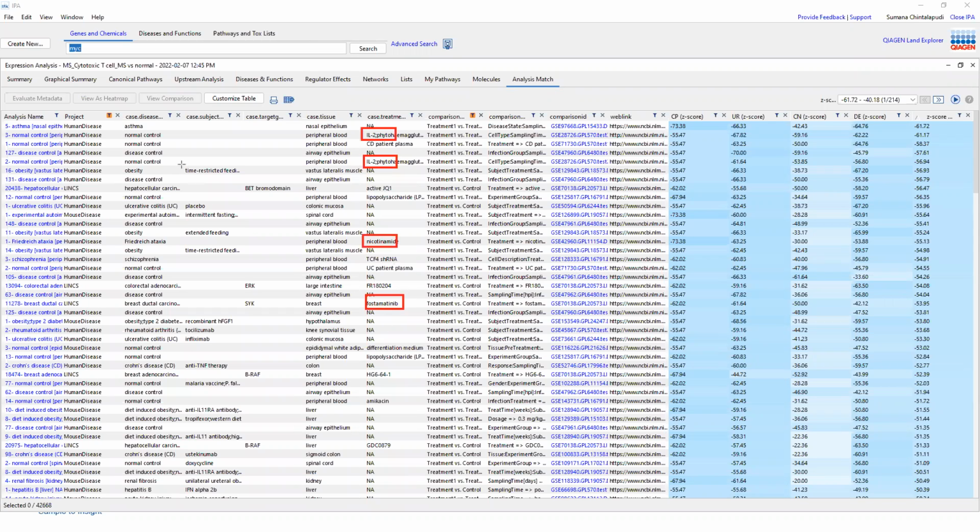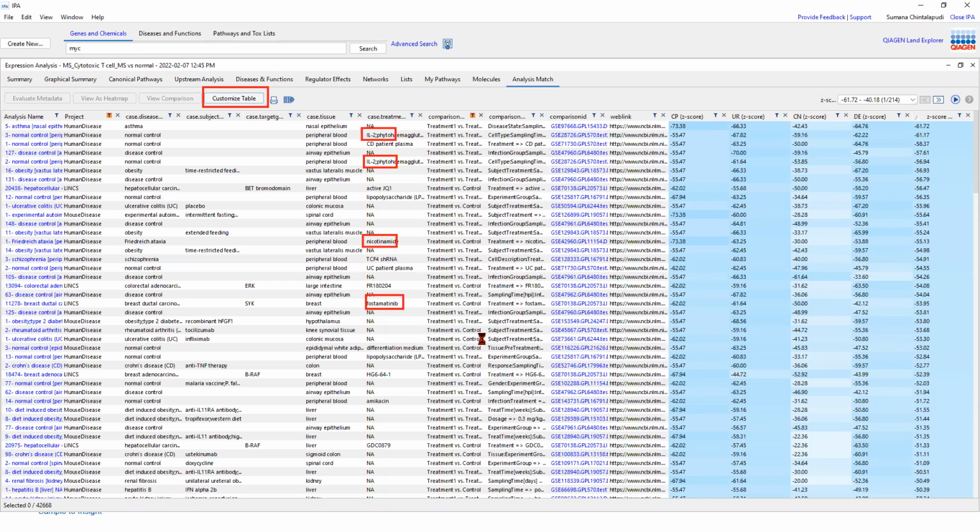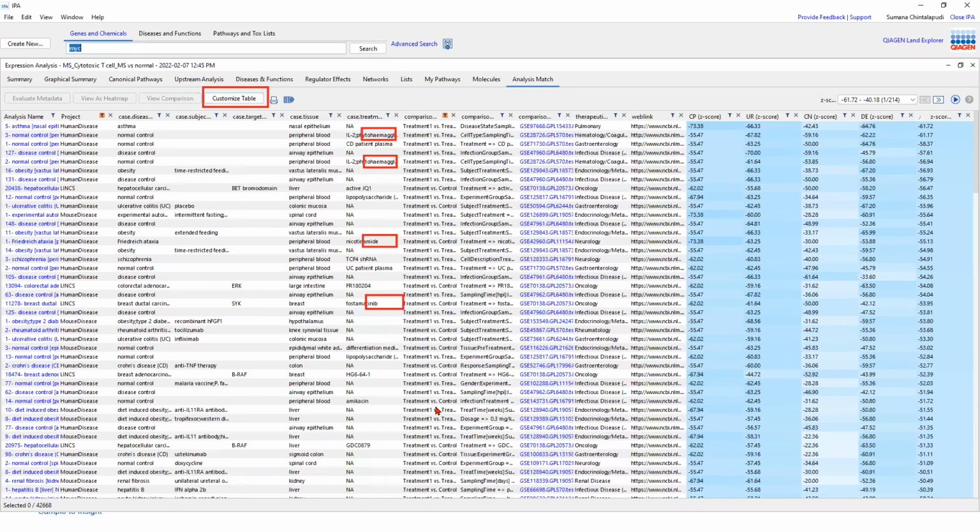And if you want, let's say you want only neurological data, you can add therapeutic area as an option. So you can select a column and add therapeutic area. And that's another column that you can use to filter for. So here we have therapeutic area. And say I only want neuro and click apply.